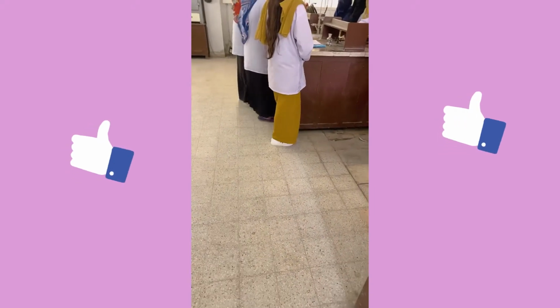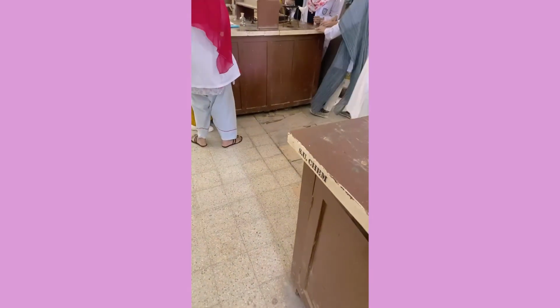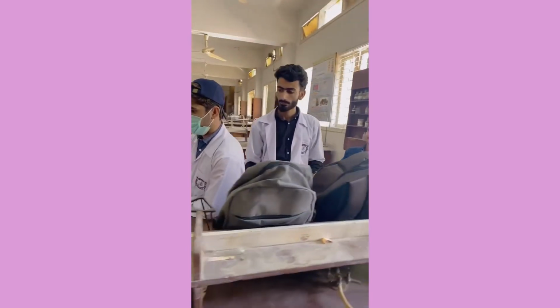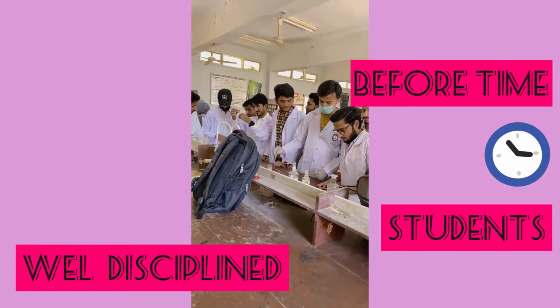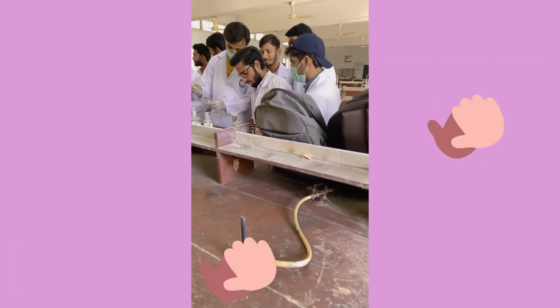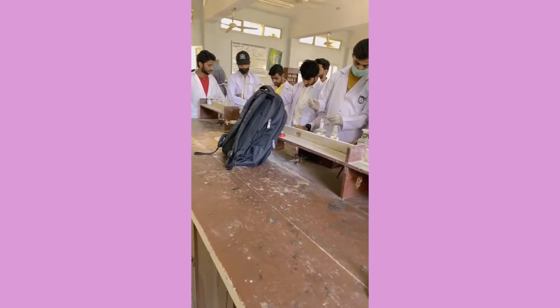The girls are over there, they are also working. I'm not showing them, but the whole class, the whole group is here today all together to finish up the 8th experiment. I was thinking in the beginning that we wouldn't be able to finish it, but the boys are very regular, and the girls are also very regular. They have been very punctual and disciplined throughout their experimental session, and I appreciate that. This enabled us to finish our work within the due period of time.